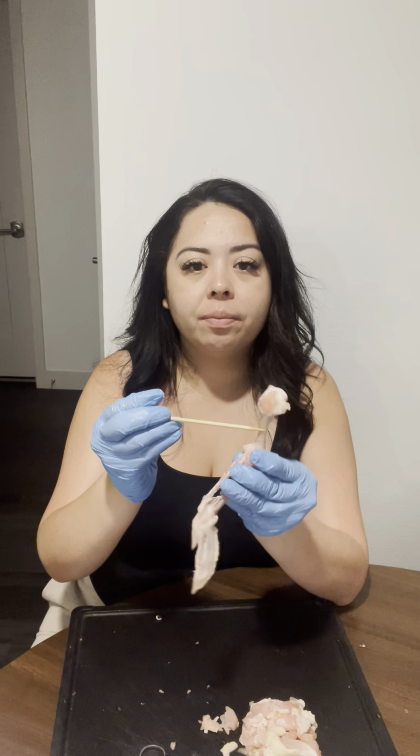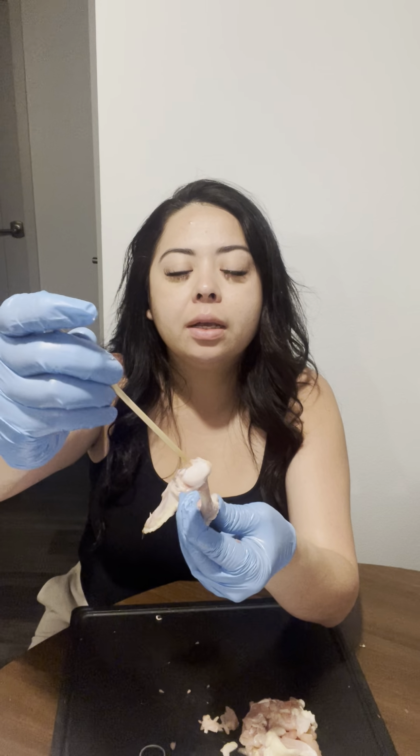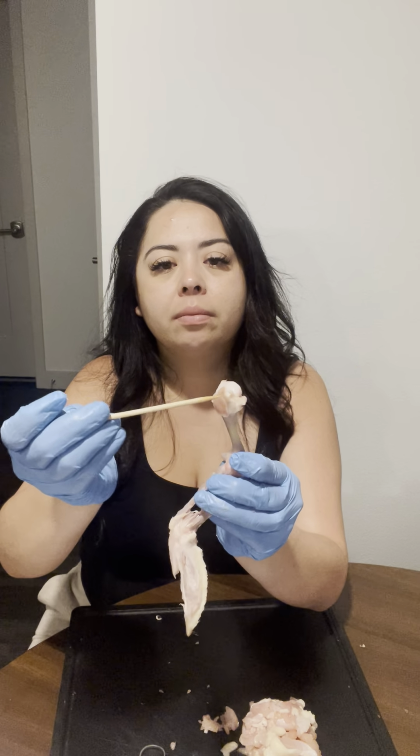So this thicker bone here is the humerus, and then this top part right up here would be the head of our humerus, and then our shoulder joint would be here. Then if we go down to this joint here, that would be our elbow joint. And then we have the joint capsule here. It's a white substance in between.